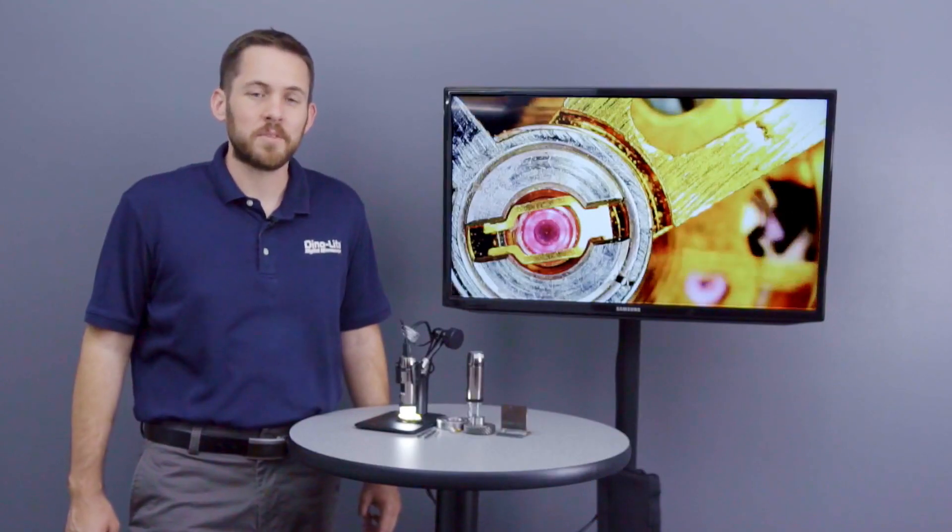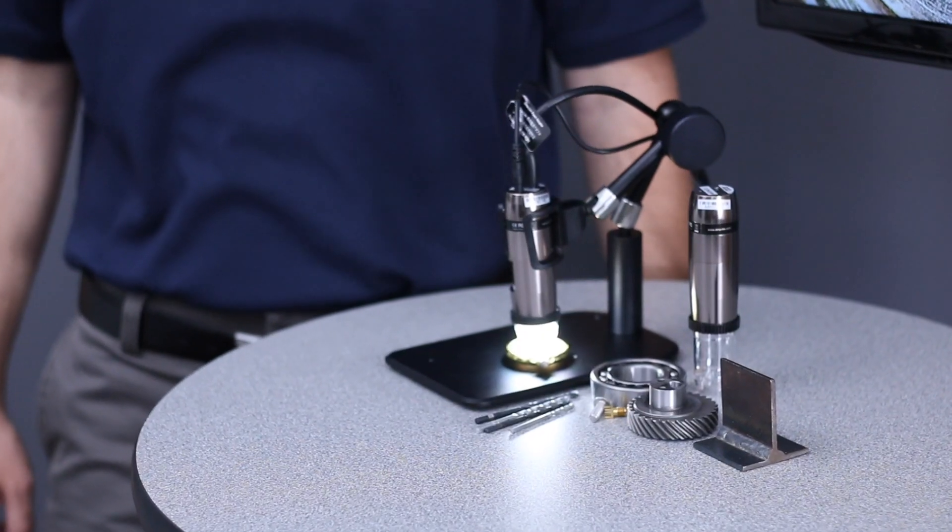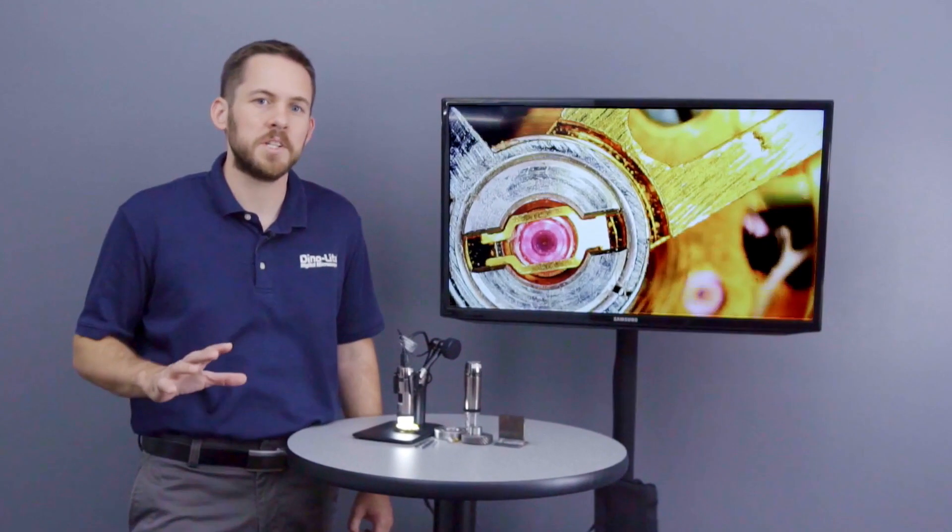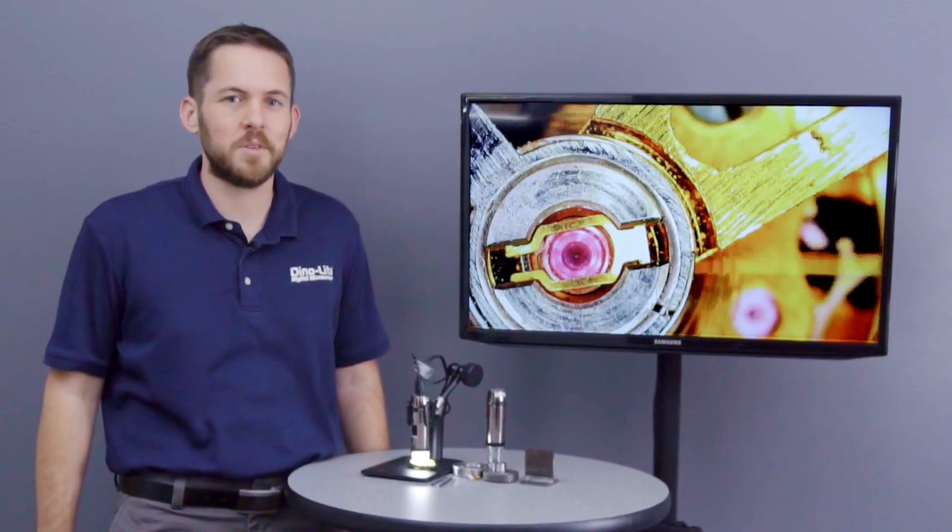These microscopes are great for live inspection. The glass lens of our edge series models feature a flat focal plane across the entire image to eliminate distortion and provide a versatile magnification range up to 220x.